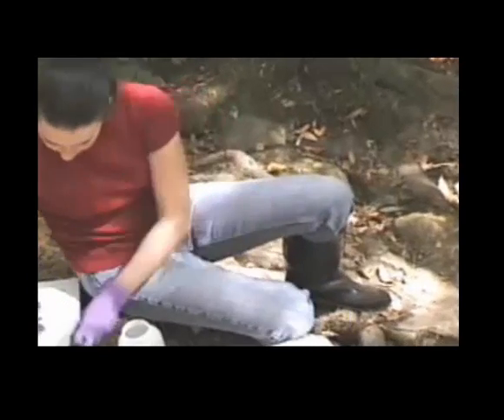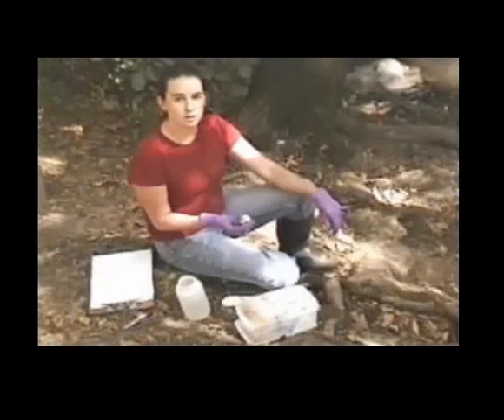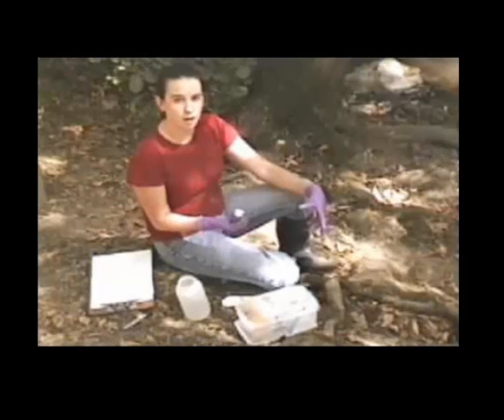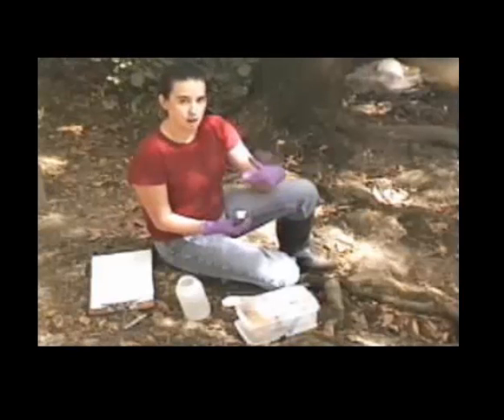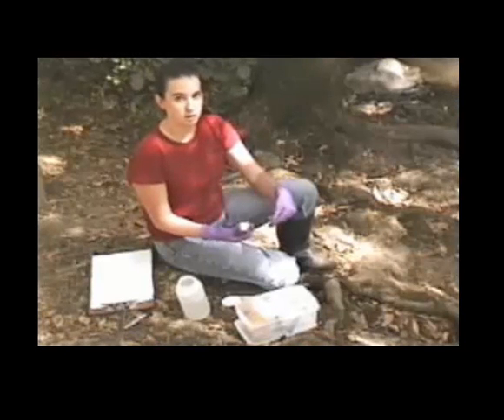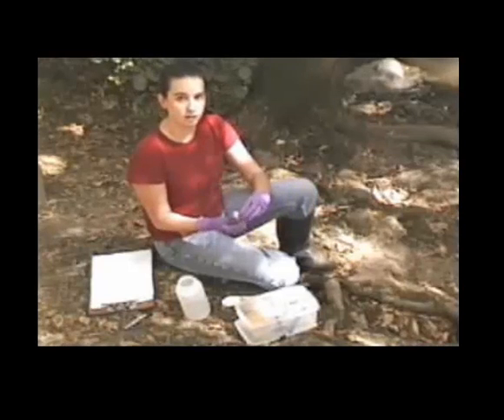So again, recording the volume. You can also get an idea for how much volume needs to move through the filter based on the resistance you get as you're pushing the plunger. The more water you push through, the harder it gets to push through the filter. It's kind of an indication that you have enough water filtered.